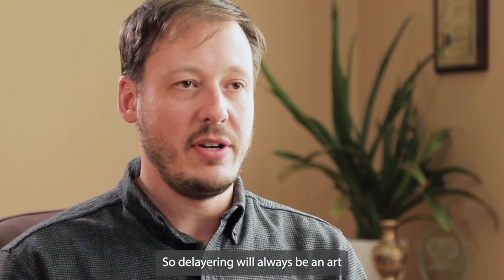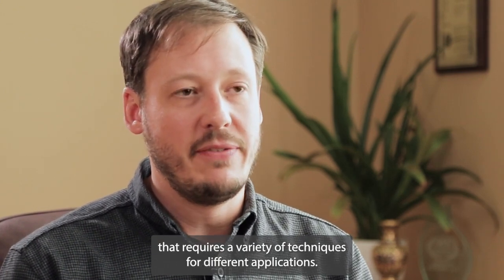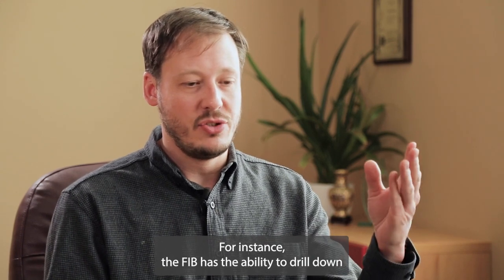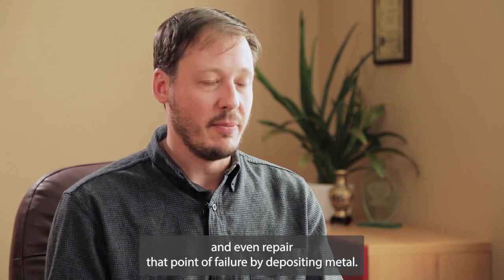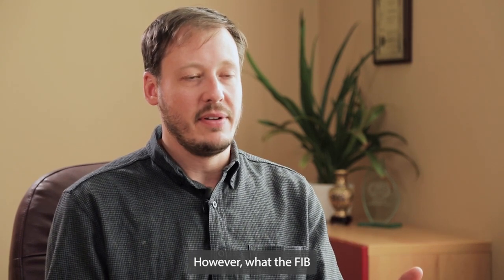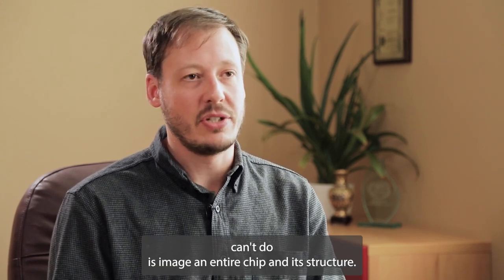So delayering will always be an art that requires a variety of techniques for different applications. For instance, the FIB has the ability to drill down to a specific point of failure that's been pre-identified and even repair that point of failure by depositing metal. However, what the FIB can't do is image an entire chip and its structure.